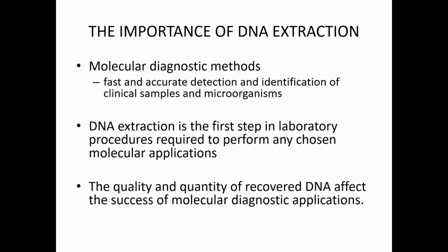For the sample that we collect for analysis, DNA extraction is the first step in the laboratory procedure. Many molecular applications require the DNA, all right, so that would be the first step.